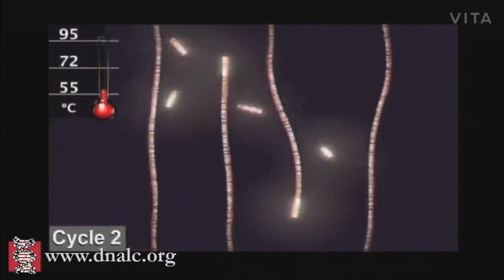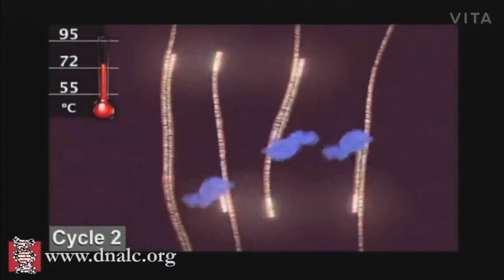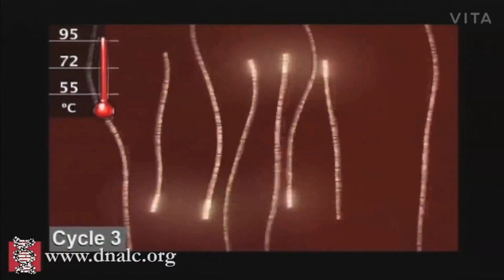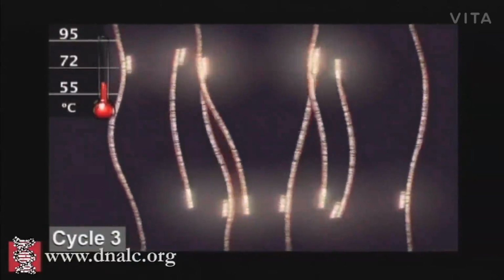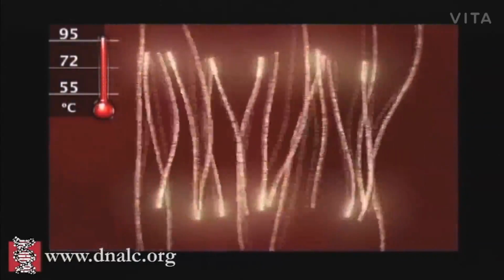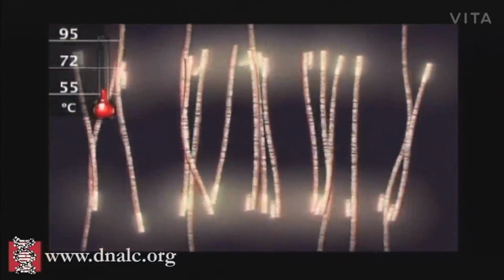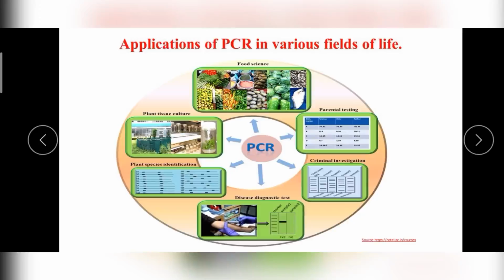In subsequent cycles, the processes of denaturing, annealing, and extending are repeated to make additional DNA copies. After 3 cycles, the target sequence defined by the primers begins to accumulate. After 30 cycles, as many as 1 billion copies of the target sequence are produced from a single starting molecule. Let's see the applications of PCR.